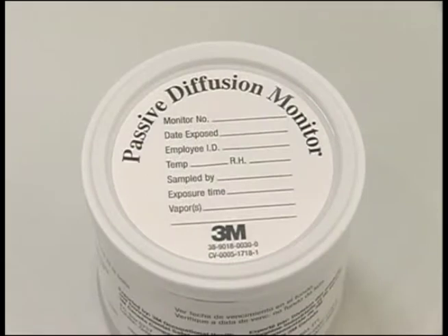Before monitoring with the 3M 3500-3520 Organic Vapor Monitor, record the following information in your data log: the monitor serial number, the ambient temperature and relative humidity, the sampling date, the compounds to be analyzed, and the employee or area ID.